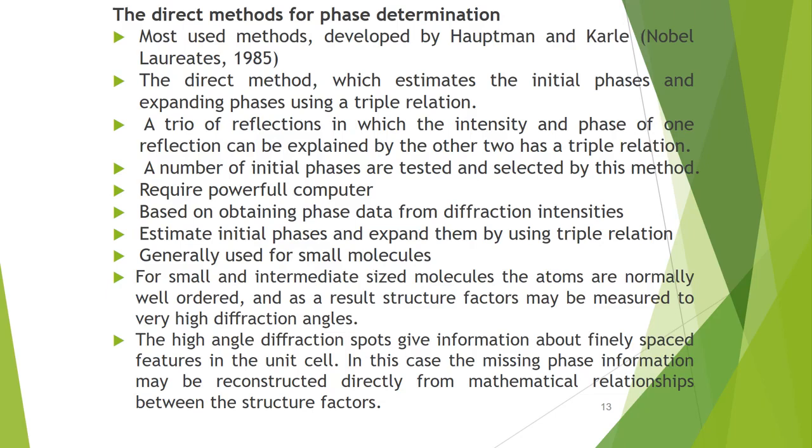A number of initial phases are tested and selected by this method. This requires a powerful computer, and must be based on obtaining phase data from diffraction intensities. This estimates initial phases and expands them by using triple relations, and is generally used for small molecules.